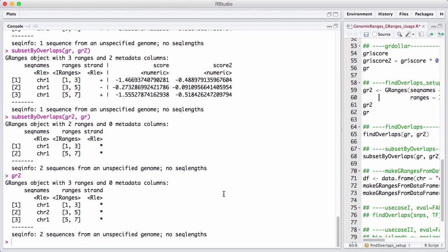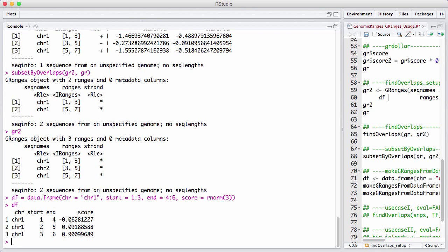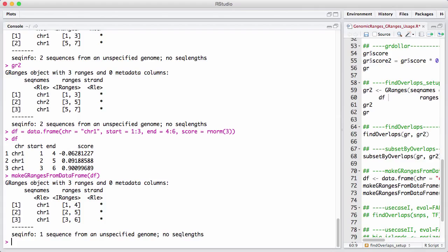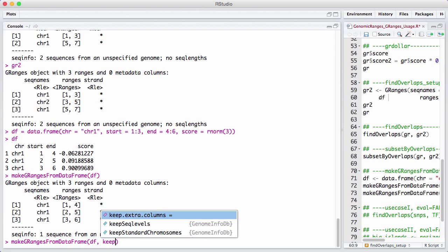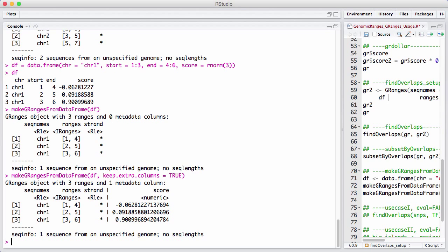Next, we'll discuss another convenience function called makeGRangesFromDataFrame. The idea is that we often have classic R data.frames that store objects that look a bit like genomic ranges, and we want to convert them. Let's make a data.frame df with chromosome equal to chromosome 1, start equal to 1 to 3, end equal to 4 to 6, and a score of some random numbers. We can convert that into a GRanges by calling makeGRangesFromDataFrame. Note that the score column gets dropped by default. You can say keep.extra.columns equals TRUE to keep that extra column.